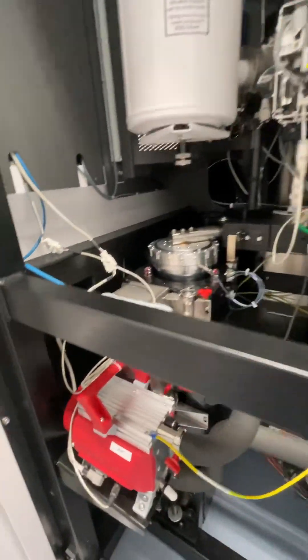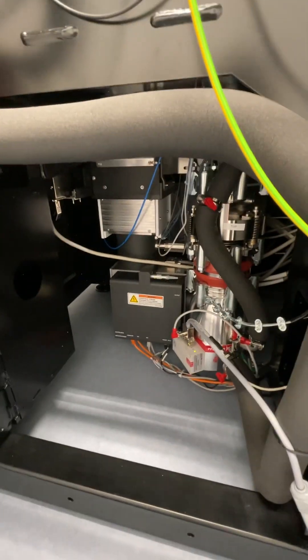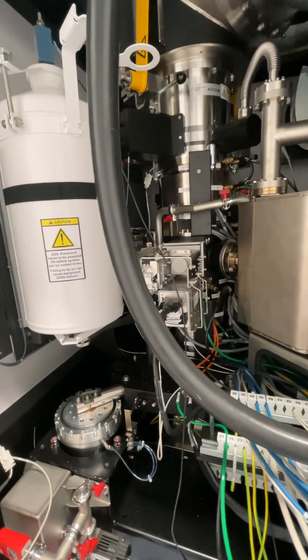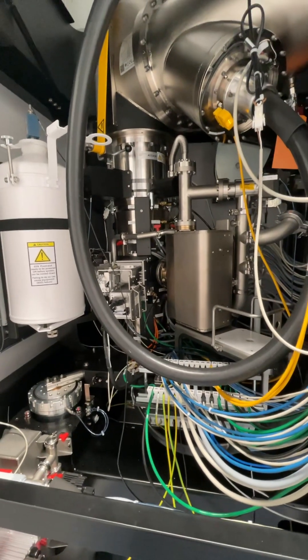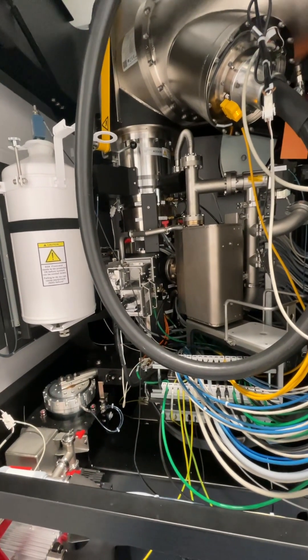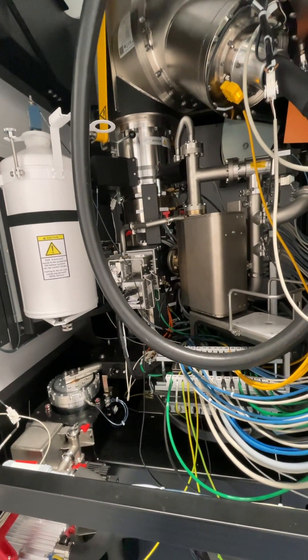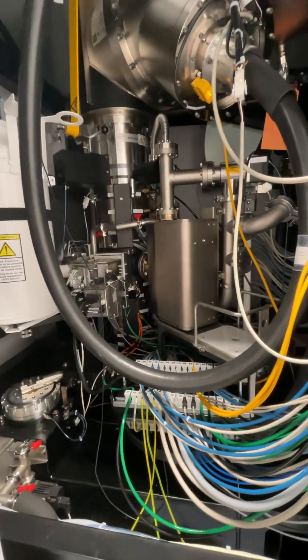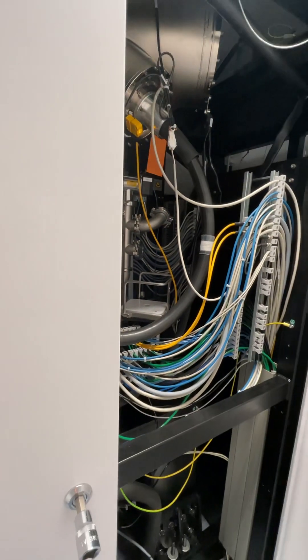We have pumps, detectors, cameras, and everything nestled in here — probably a lot of fun for engineers to service. We're on a service contract for a couple of years, which is nice. I haven't had my applications training yet, so there's not much more I can tell you. I've never used a Thermo Fisher TEM before — I've always used JEOL TEMs — so I'll let you know how that goes.